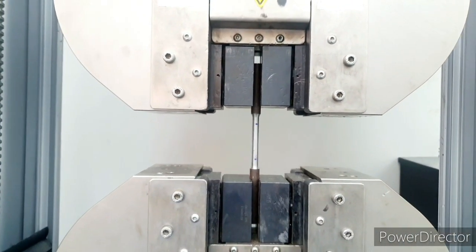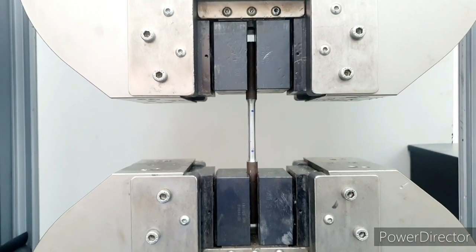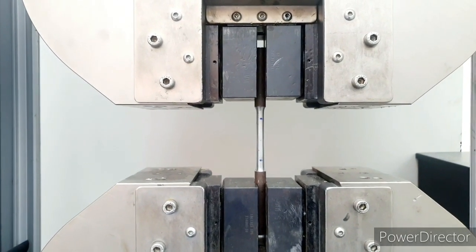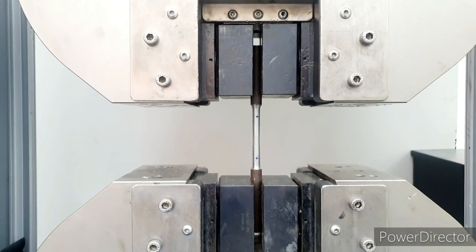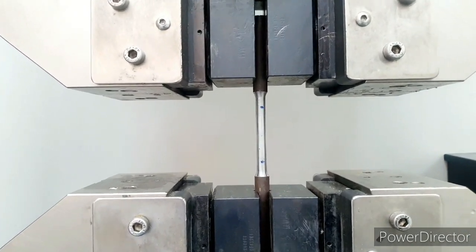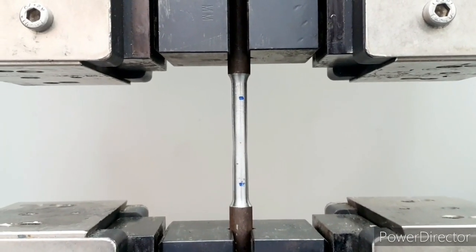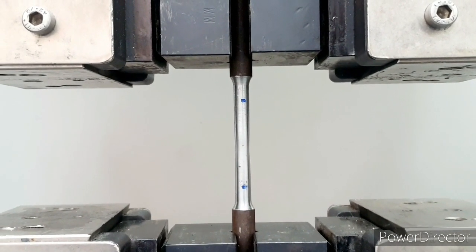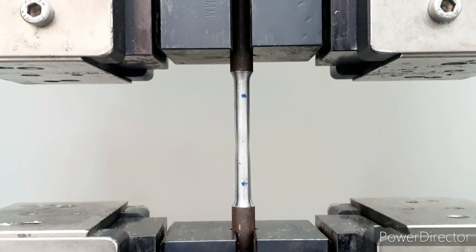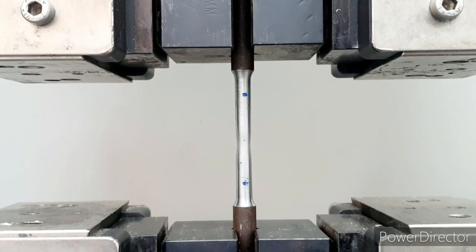You need to be very careful, wearing all the appropriate personal protective equipment, safety glasses, and gloves, as there can be breakages of small parts which can cause problems. So we are still pulling the material. You can see it's getting thinner in the center. And finally it will break.